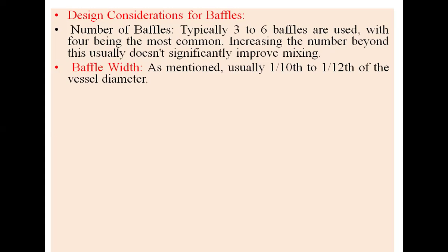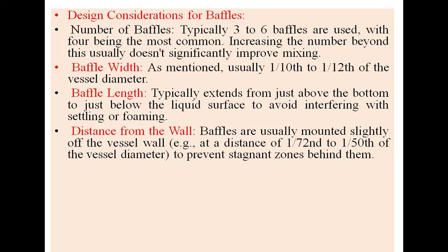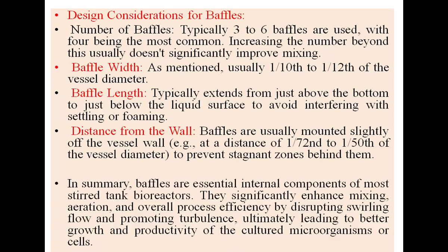Coming to the baffle width, as mentioned, usually 1/10 to 1/12 of the vessel diameter is acceptable. Then the baffle length typically extends from just above the bottom to just below the liquid surface to avoid interfering with settling or foaming. Then the distance from the wall: the baffles are usually mounted slightly off the vessel wall, for example at a distance of 1/72nd to 1/50th of the vessel diameter, to prevent stagnant zones behind them.